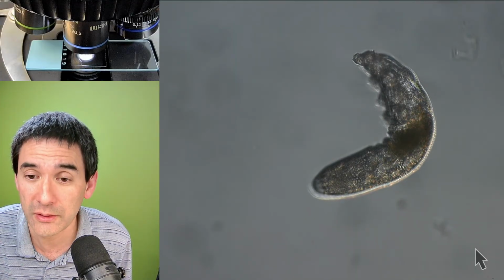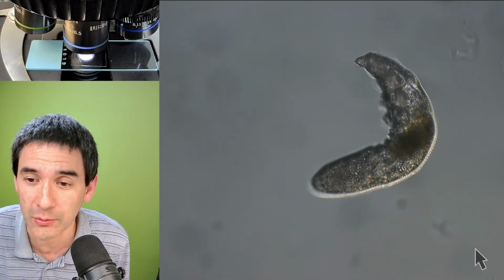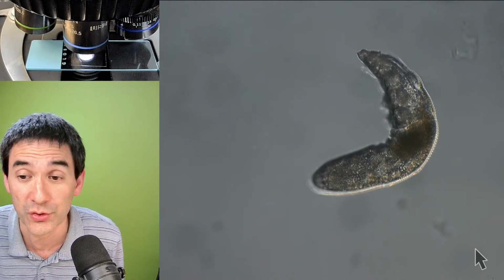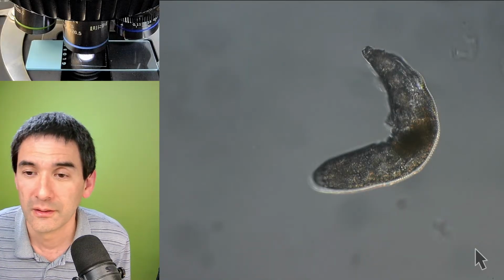Thank you again. Ever smaller says that in their reading, the dog ones, the Demodex canis, are the most widely researched, even more so than those in humans. Oh, interesting. Okay.